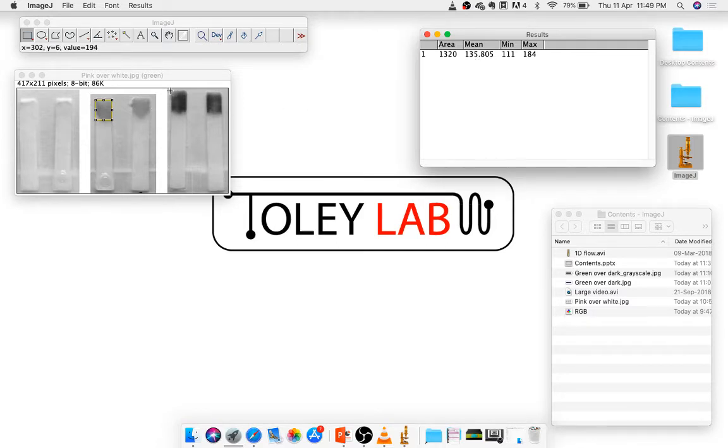And now if I make a similar box, you could make a box of exactly the same size using the specify selection numbers, but I'll roughly try to make something similar. I can again do analyze, measure. This measurement comes in the line below the top line, and you can see that because you are going from a brighter to a darker color, my mean intensity decreases. And if you just hover your mouse pointer, you can see that in the absence of glucose, my numbers are somewhere around 195. Here they're around 120 or 130, and here they're 50 or 60.